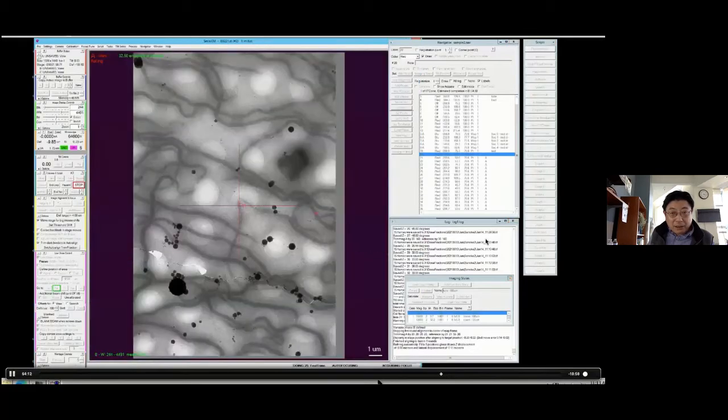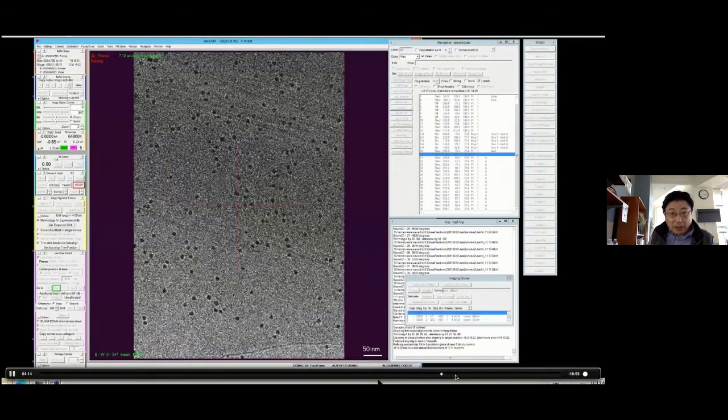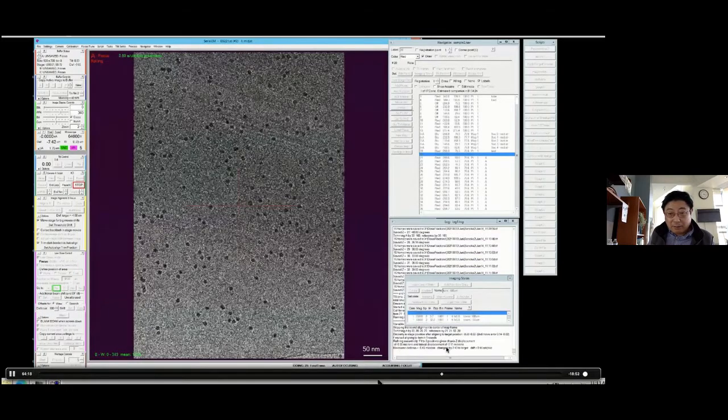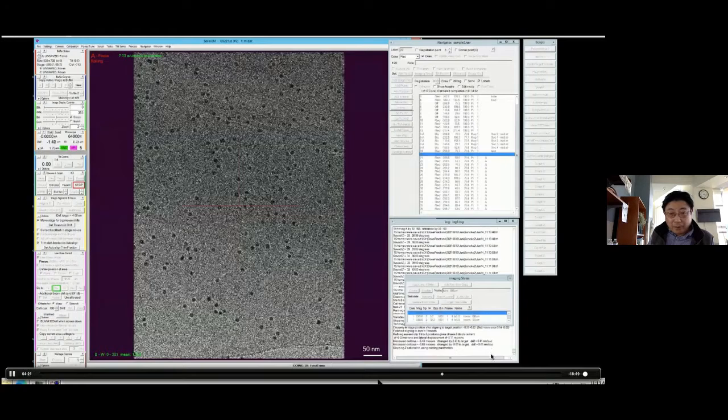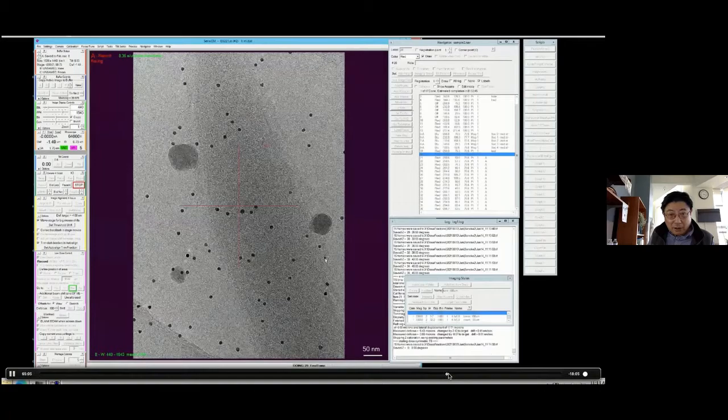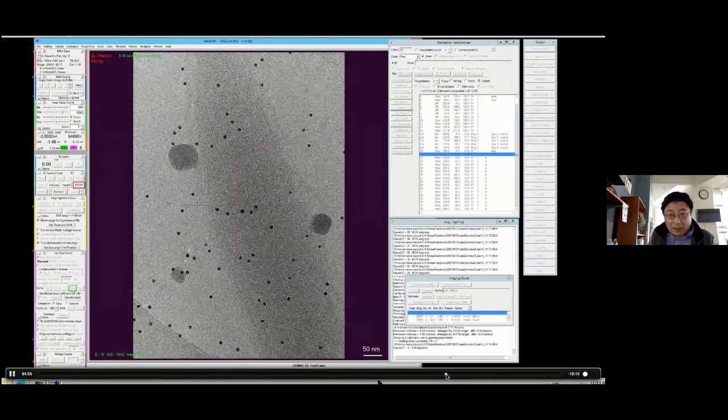This is basically just watching a very simple focus again, and then everything else will be similar. Let me speed up a little bit. Here it is. Okay, so what's happening is that when they are collecting data, it's boring, and you can do another thing we call dummy.